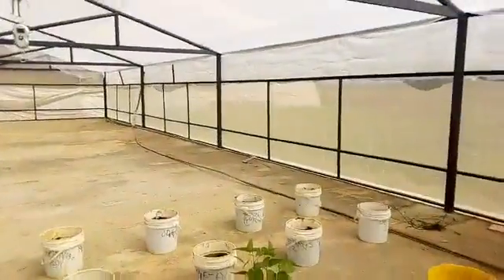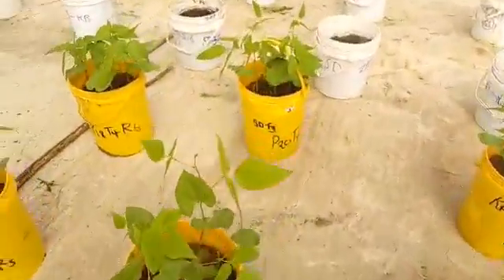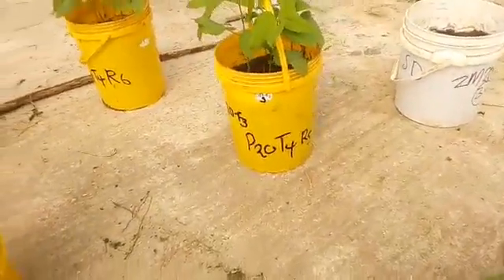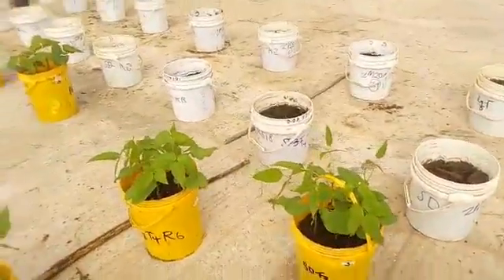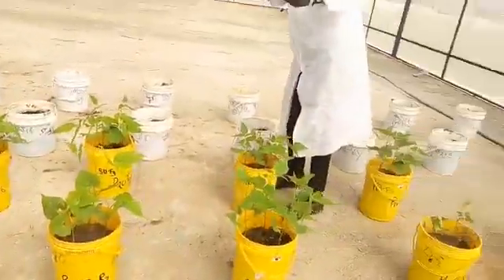Okay, that's noted. So that's Sazu. Maybe you could show us another pot, a different treatment. Like I need to write some, yeah? Oh yeah, so we have to record our measurements. So that's what we're doing right now, just taking the recording. So this pot was from block 3, and the label for this pot is P20 treatment 4 replication 5. Our treatment 4 is the Sazu soil that we got. In fact, it's Mbereshi soil that we got, but we planted Sazu. Okay, did you take that? It's 12.00 kgs.